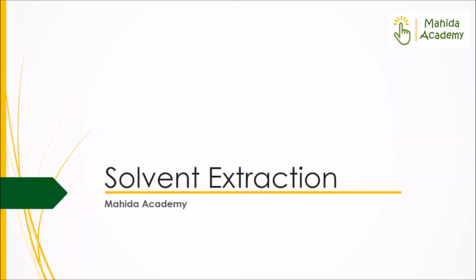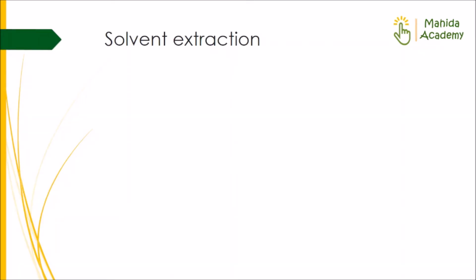So in this lesson, we will learn about solvent extraction. So what is solvent extraction? Solvent extraction is a separation technique.